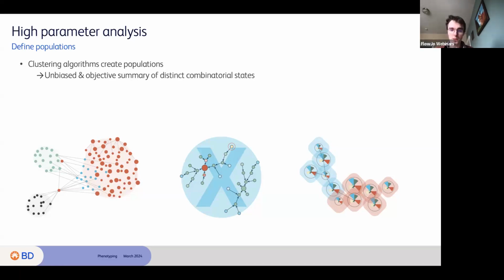If you're not familiar with using the clustering tools or our plugins, I apologize, but we're going to start with some already finished clusters for this webinar today, and I'm not really going to go into the specifics of how clustering works. We do have a lot of other great webinars about clustering and how to set up the clustering tools. For today, just follow along and know that clustering gives us a bunch of populations as the result, and those populations represent phenotypes.